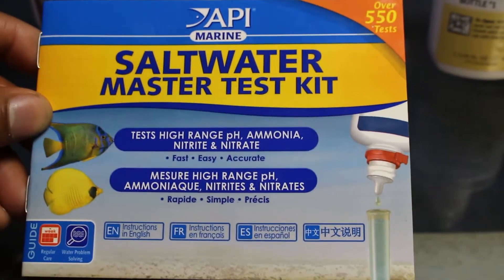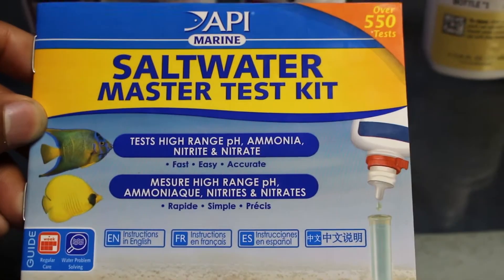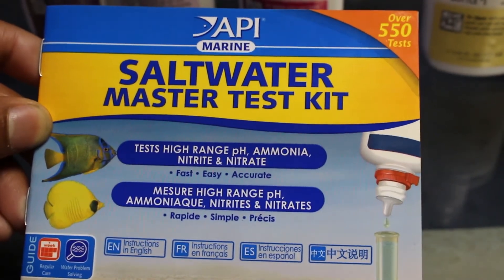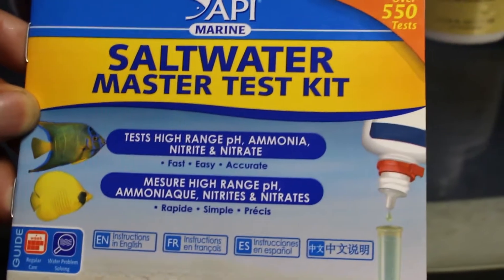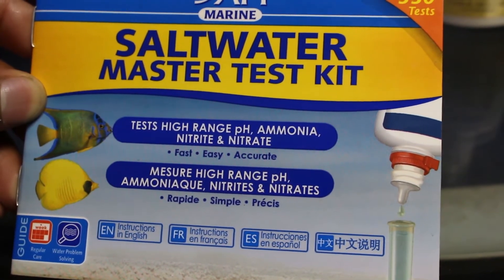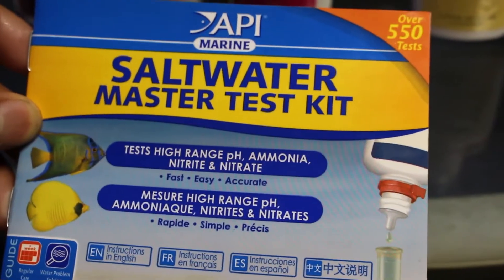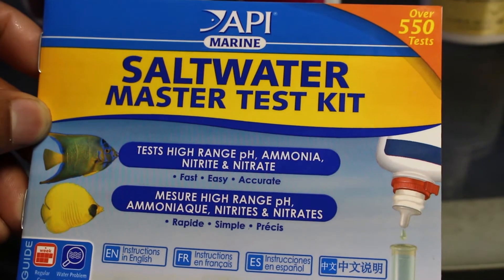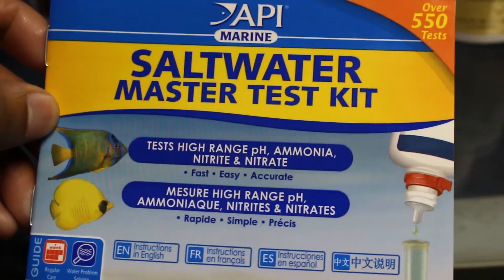Hey guys, I'm going to be showing you how to test your saltwater tank for beginners. This is by far the easiest test kit you can use when starting out. There are better test kits for more accurate readings, but for beginners this is a good go-to and it's not expensive at all. This is the API Marine Saltwater Master Test Kit — it also has a freshwater version too.